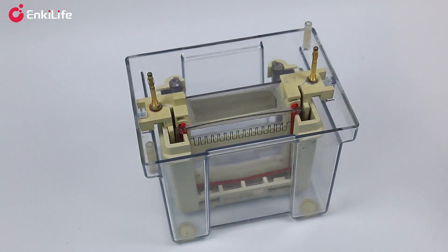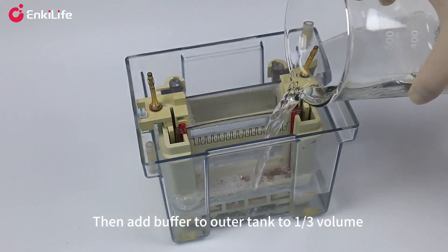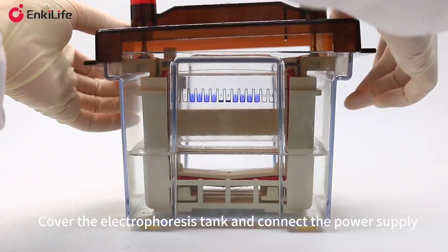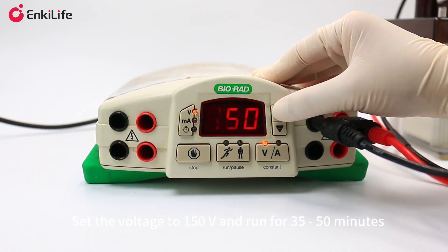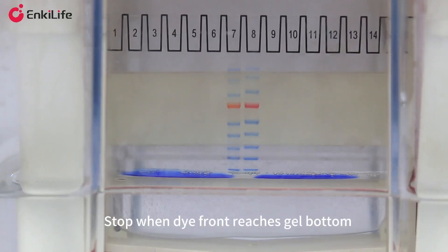Stand one minute to check for leaks, then add buffer to the outer tank to one-third volume. Load 5 to 25 microliters of sample vertically into the wells, then load 2 to 5 microliters of protein marker. Cover the electrophoresis tank, connect the power supply, set the voltage to 150 volts, and run for 35 to 50 minutes.